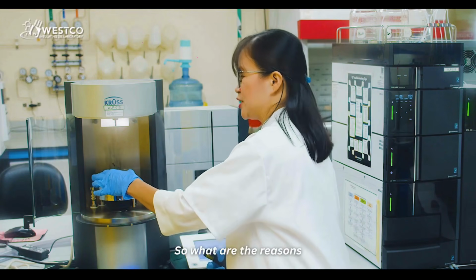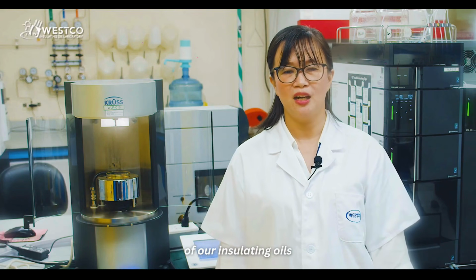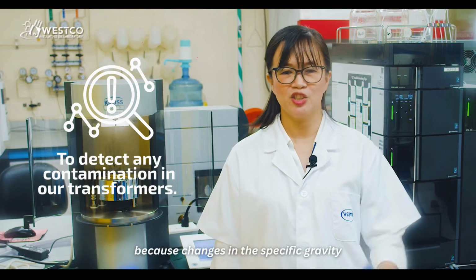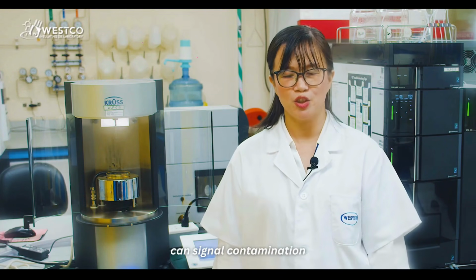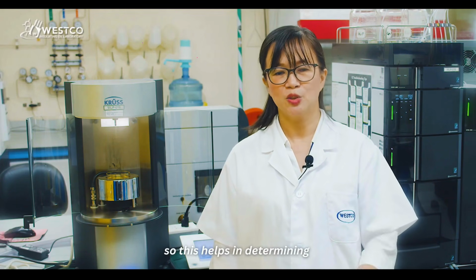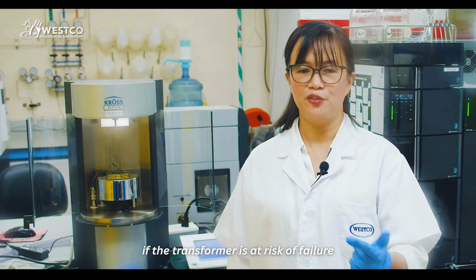So what are the reasons why we need to test the specific gravity of our insulating oils? First is to detect any contamination in our transformers, because changes in the specific gravity can signal contamination, for example, contamination of water in oil. So this helps in determining if the transformer is at risk of failure.